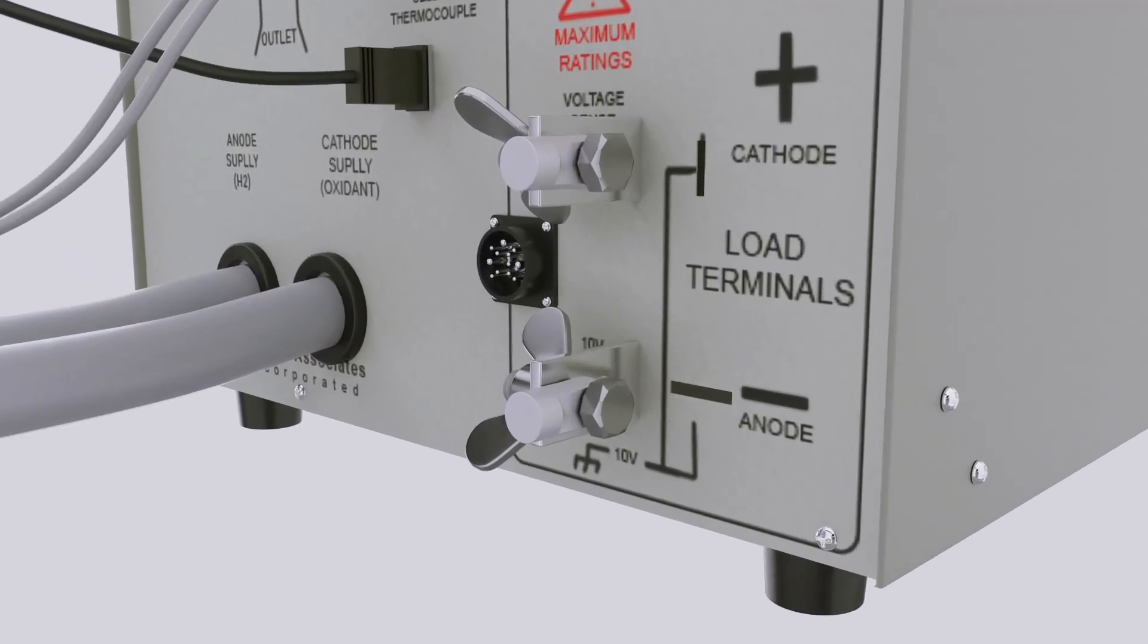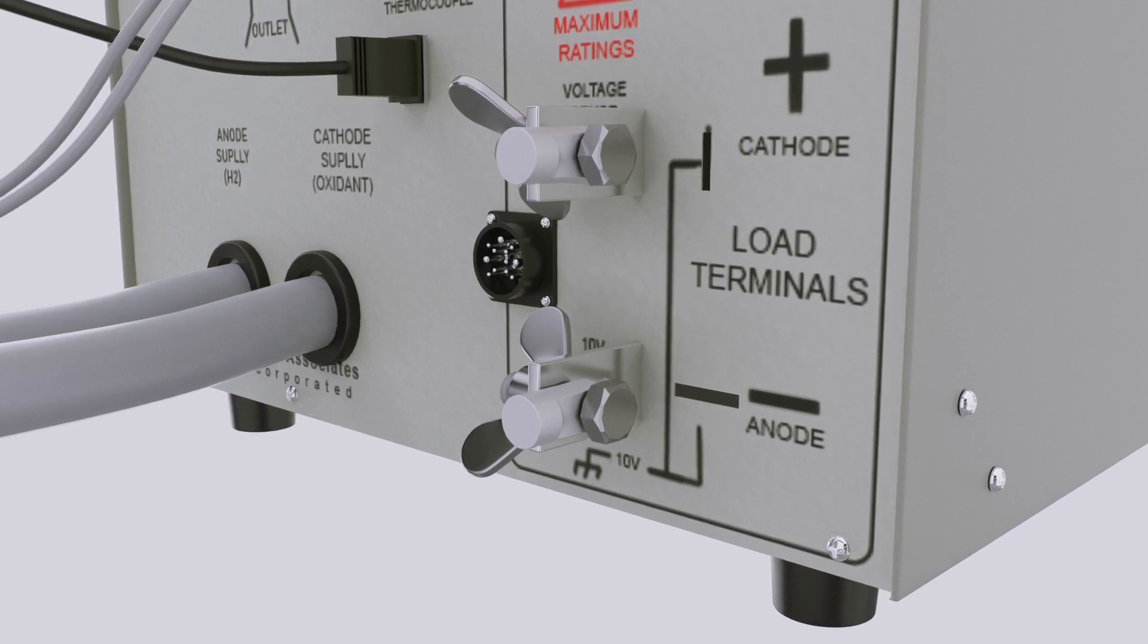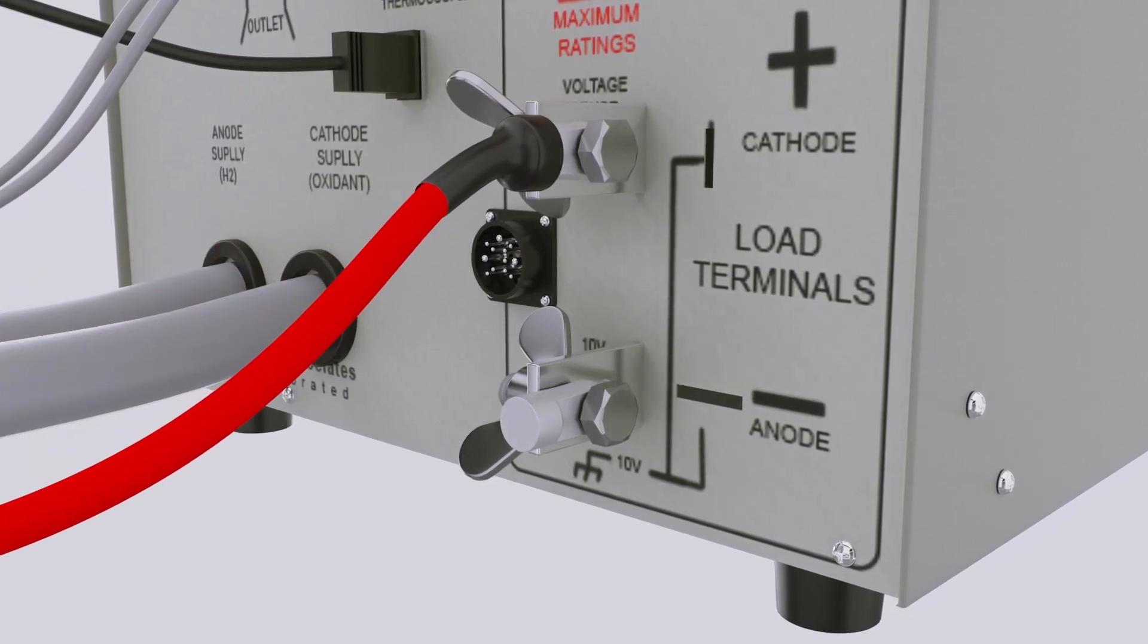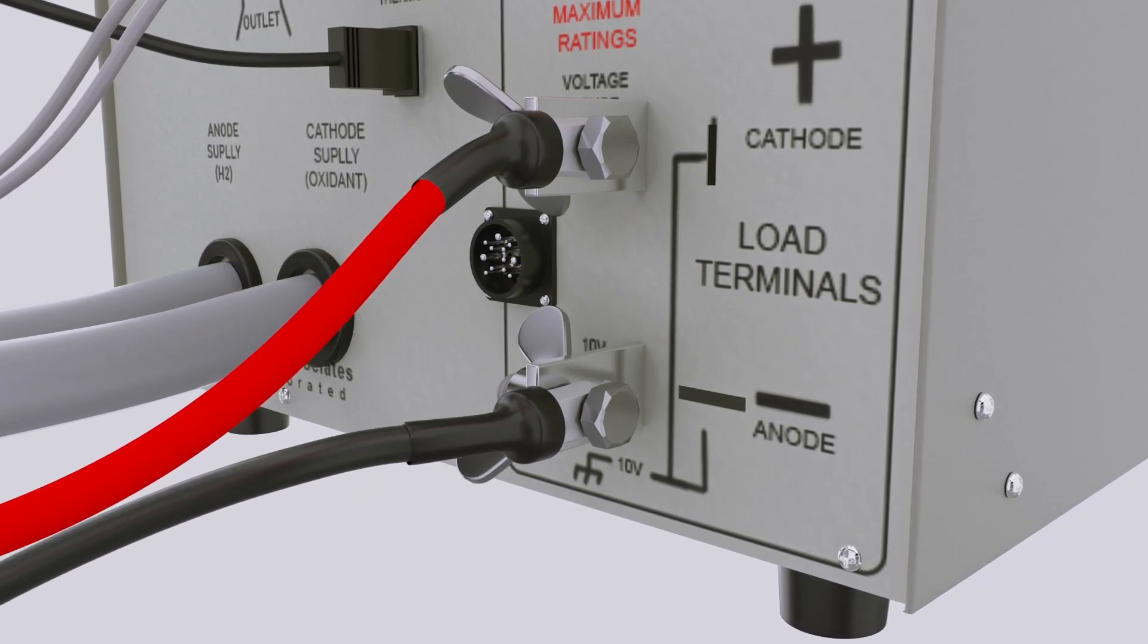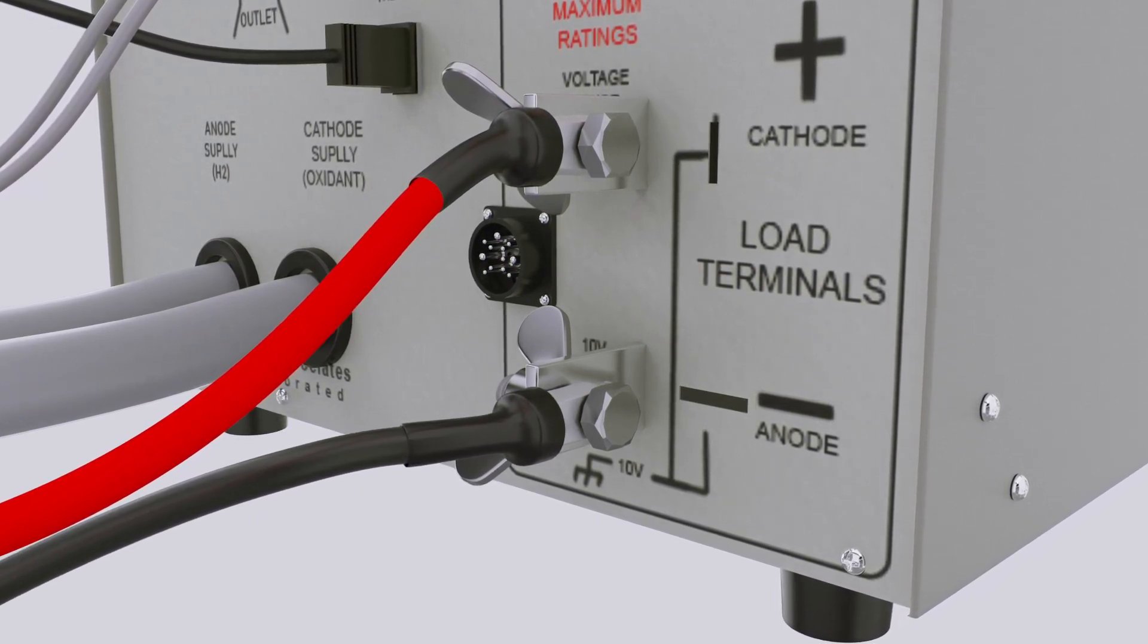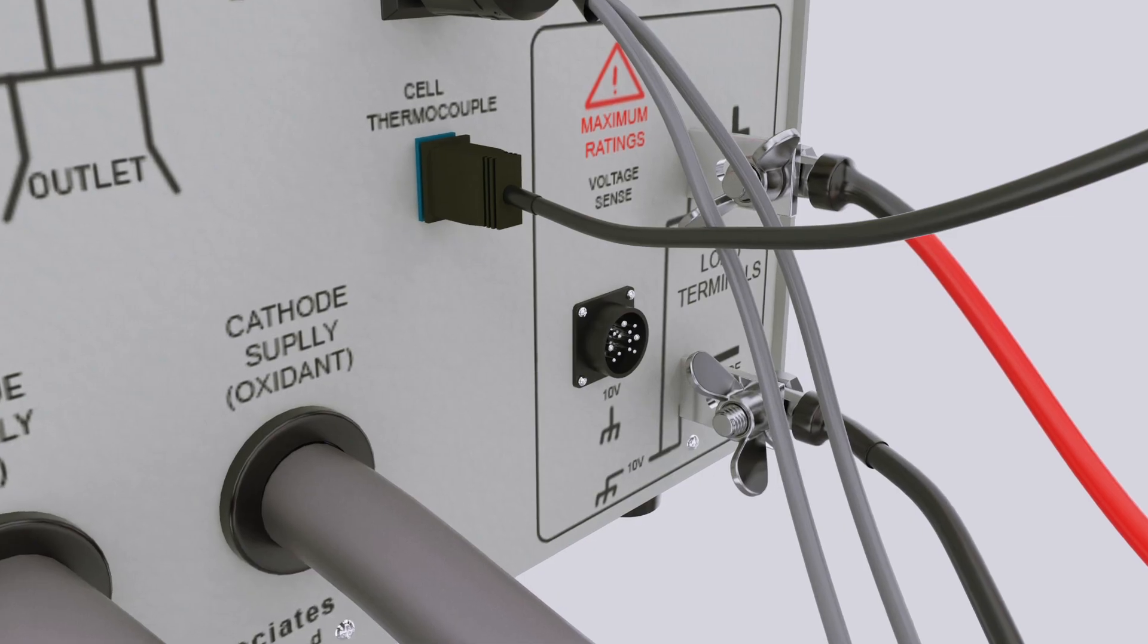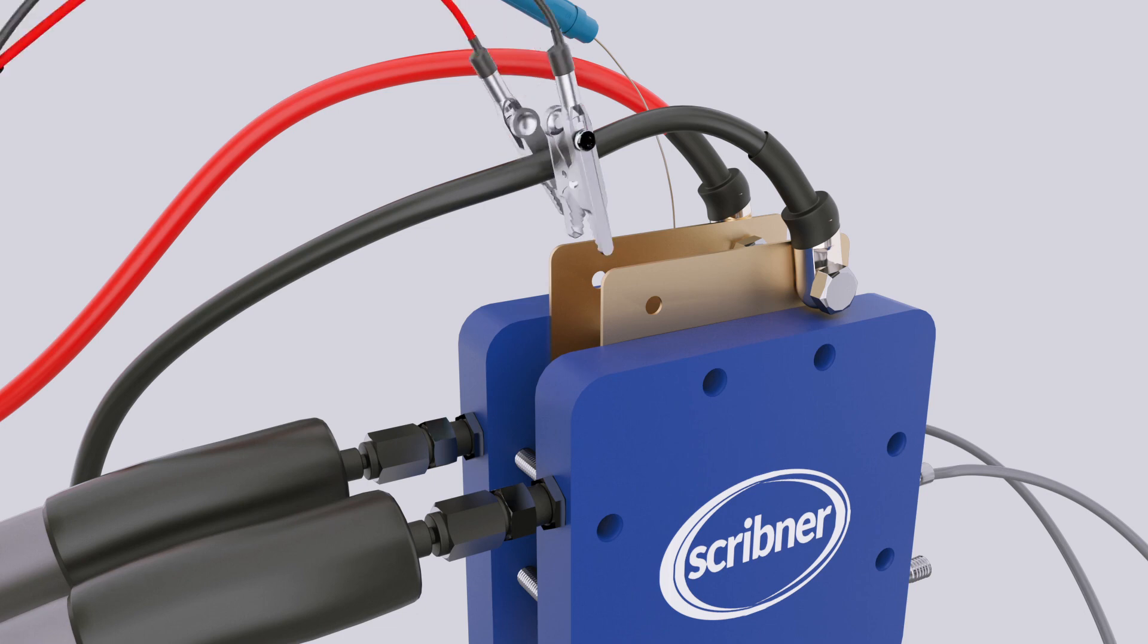Connect the cell fixture load cables to the 850 bus bar terminals. Note the standard color convention of red to positive and black to negative. Voltage sense leads follow the same convention. Connect the voltage sense cable to cell fixture current collector plates.